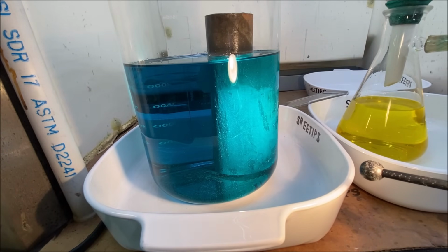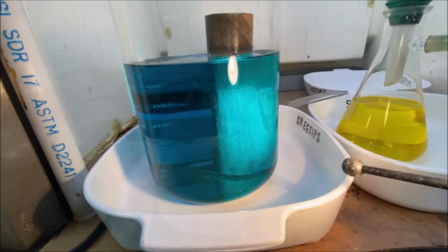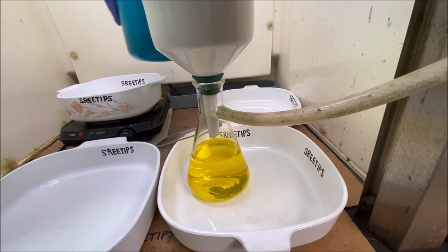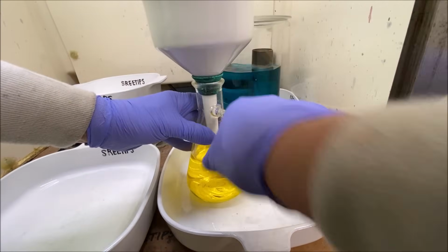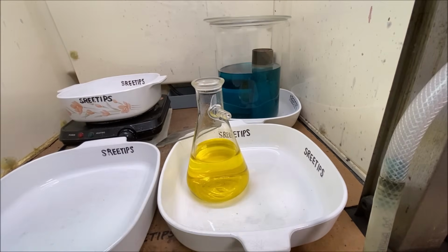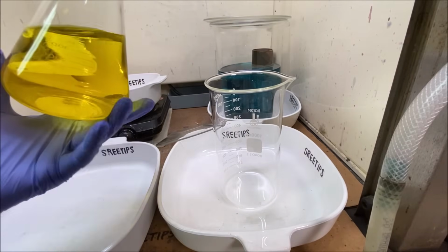And once we get all this silver cemented out on that piece of copper, I'll rinse all the blue liquid off of it, melt it into shot, and run it through my silver cell. Let me move this copper reaction, silver reaction back here out of the way. Here I've got my gold solution. And what we'll do with this is pour it into a beaker.